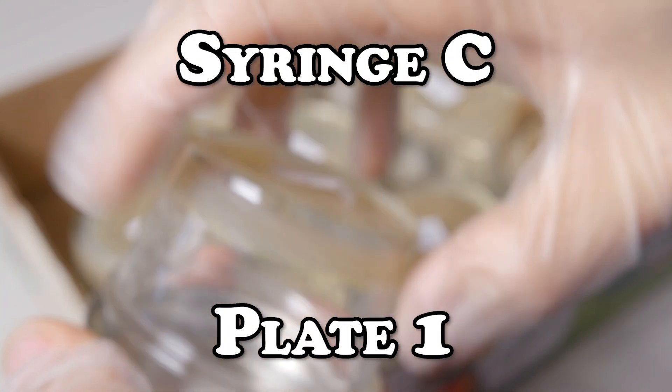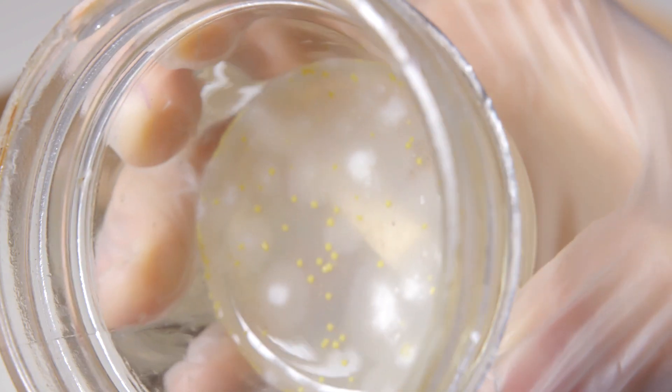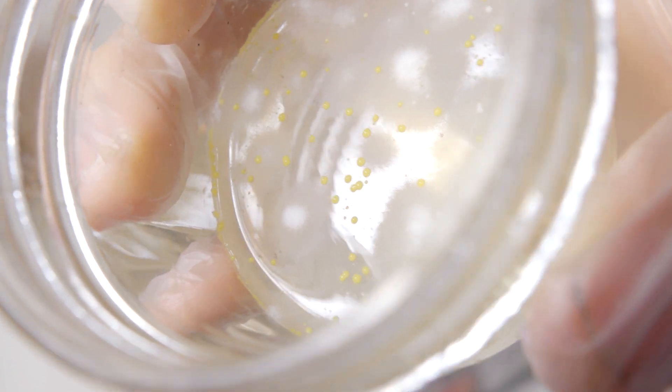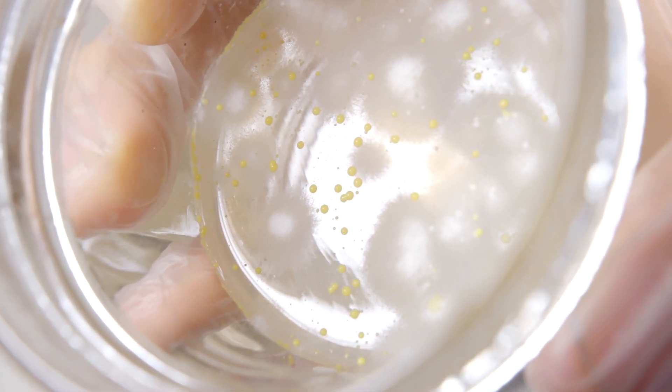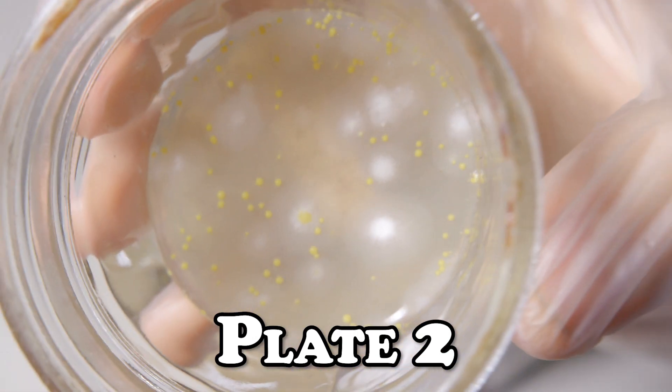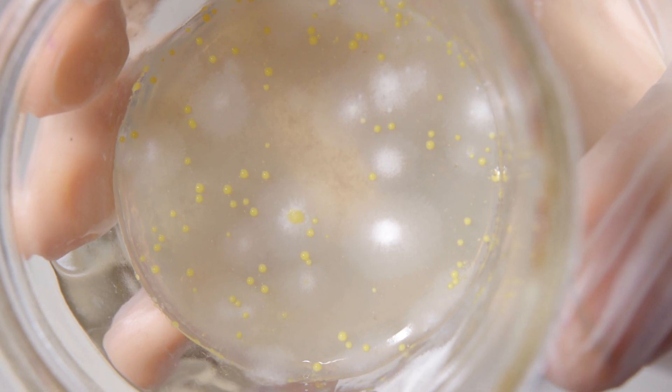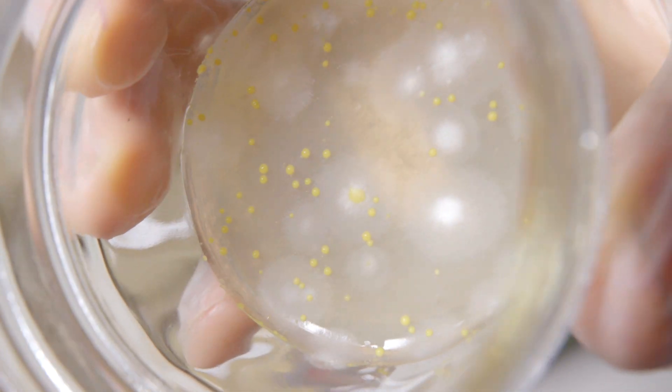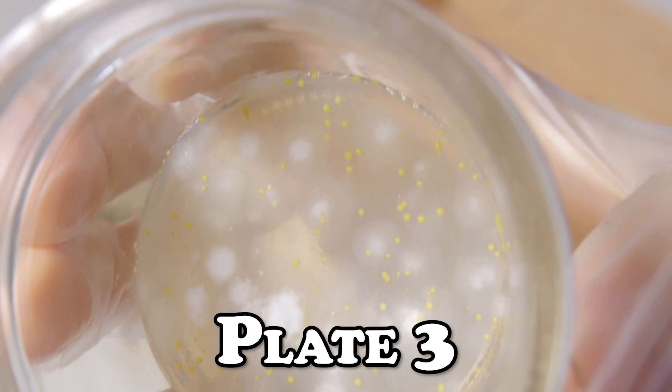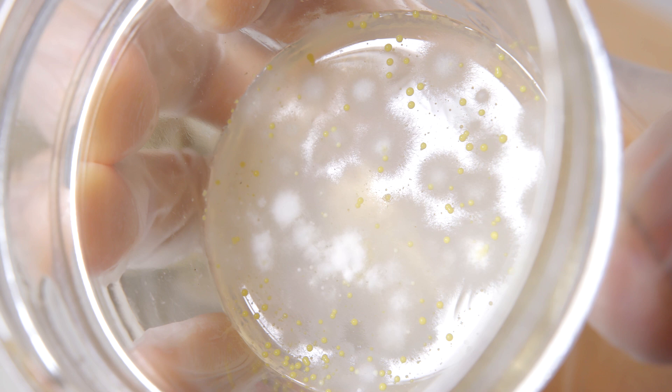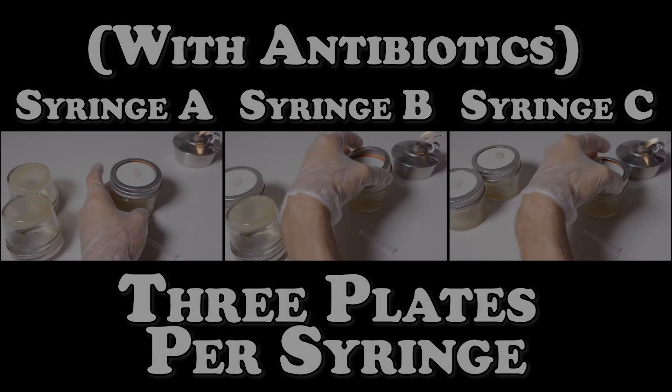Let's take a look at the first plate of syringe C and see what we're working with. It looks like we have an even distribution of mycelium and a different kind of bacteria now. This is fascinating because every plate we've seen is growing a different type of bacteria that is only found within the plates of its set. This points to a possibility that this manufacturer may have different spore print suppliers. While the manufacturer itself may be completely sterile during the production of its syringes, these contaminants could have piggybacked onto the spore prints themselves during printing. Now that we've gone through all of our plates, let's focus on how we can solve our dilemma with the cards we've been dealt.